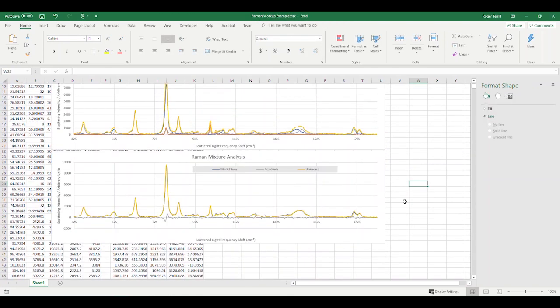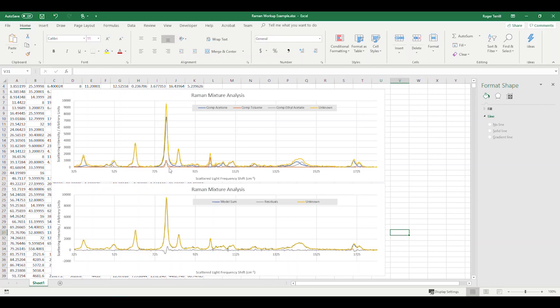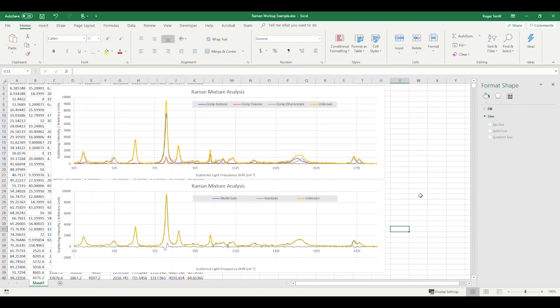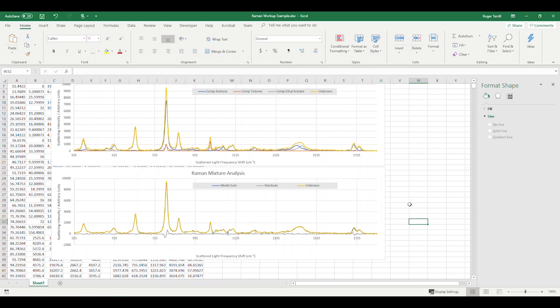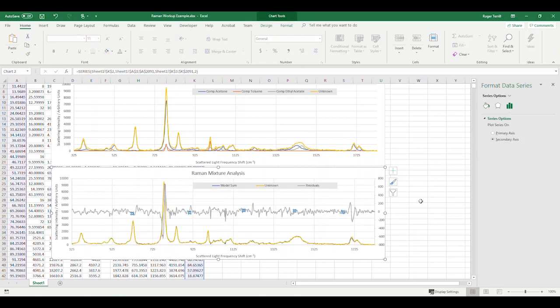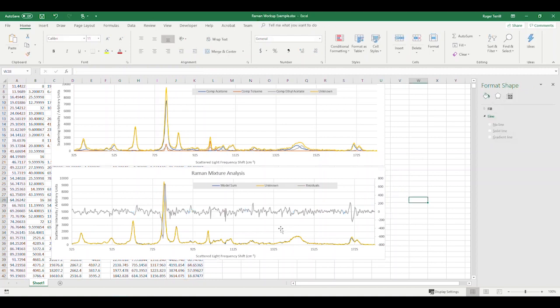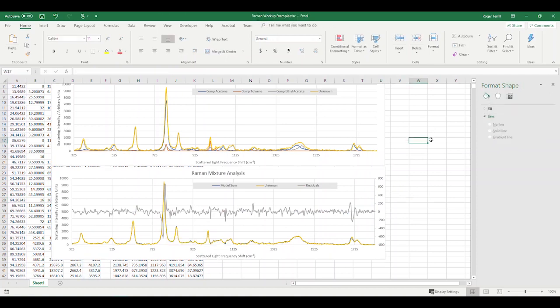So, what this shows us is how good the overall fit is. And where there's any uncertainty in the fit. So there is a glitch right here, which indicates a slight frequency shift in this large peak at like this 800, or this 780 wave number peak. So that's slightly solvatochromic, we might say. It has a slight shift in wavelength as a function of frequency. And there's another similar shift over here. But, basically, this looks really good. We might actually want to put this on its own axis. So we can put this on a secondary axis there, just to sort of illustrate the differences. And we can make this guy, maybe, well, anyway, we'll leave that as it is, not going to mess with the color.